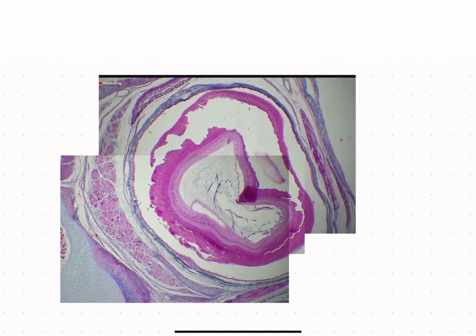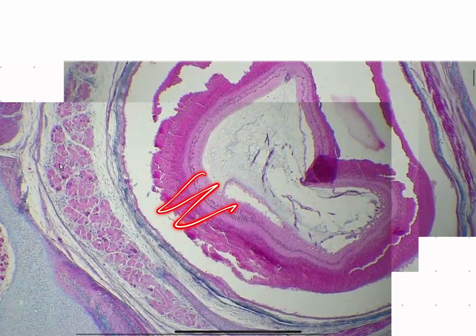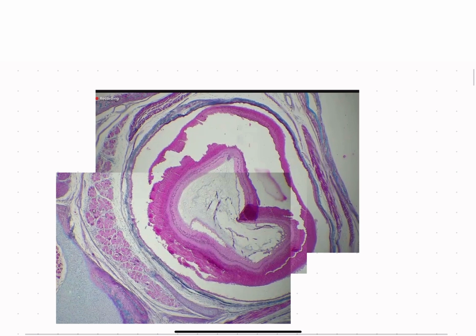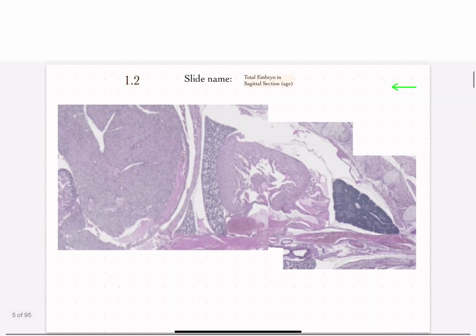And of course, the neural retina looks, again, a little bit segmented and not as characteristic as we usually like it to be, but it's still the neural retina, and it still could be a structure that they bring forth. This would be the vitreous body. We have the pigment retina right here. Let me see, and yeah, that's it for this specific eye. We also have the intraretinal space right there.